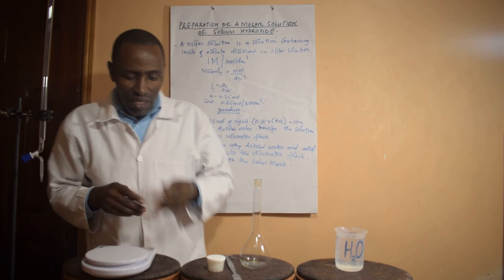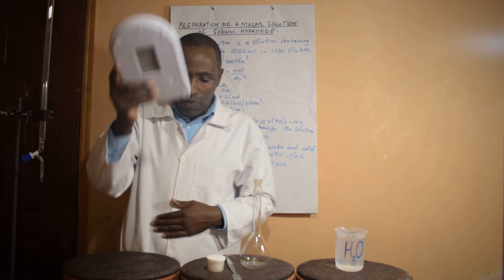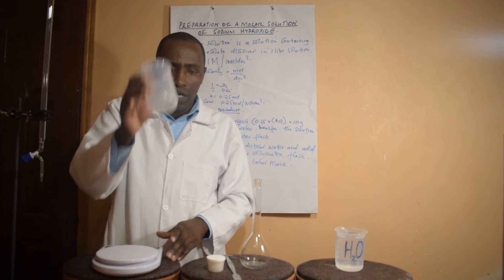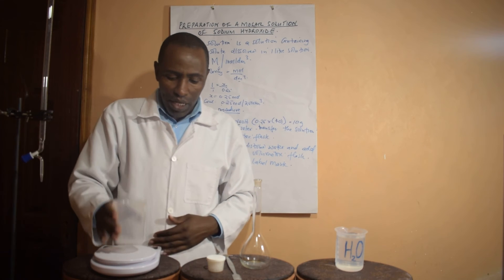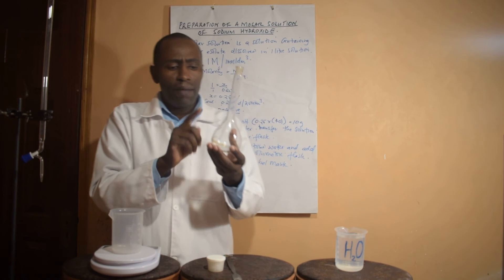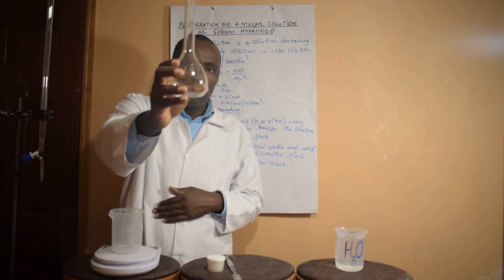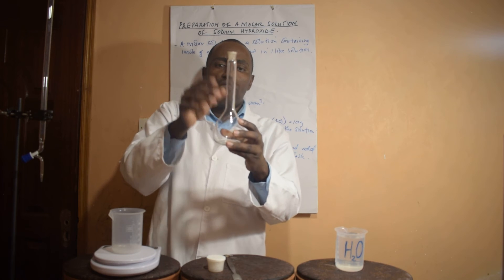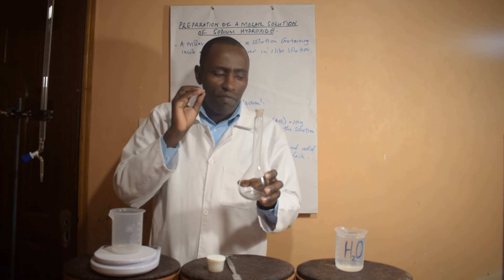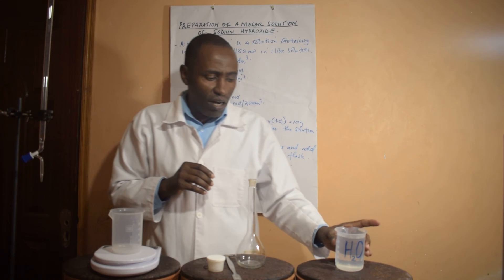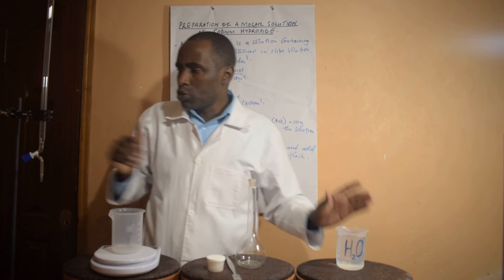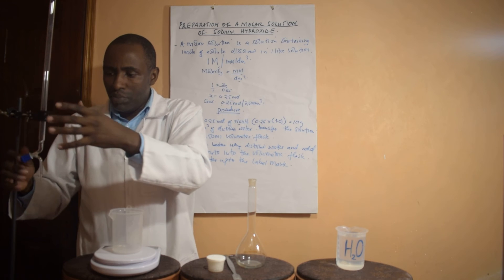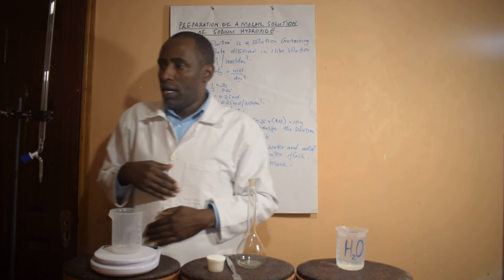Let me take you through the apparatus we are going to use. I'm going to have a weighing balance to weigh the sodium hydroxide. I'll also use a beaker. A very important piece of apparatus is the volumetric flask, used for accurate measurement of volumes — in this case we require very high accuracy. I'll also have distilled water and a burette with a stand.